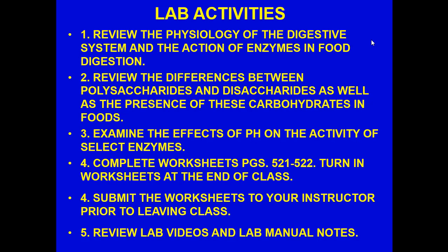And usually with just this basic experiment, you can see the difference between a polysaccharide and a disaccharide and the influence of just one enzyme on them, and the way that we measure the presence of carbohydrates in foods. You also get an understanding of how the effects of pH may affect the activity of selective enzymes.